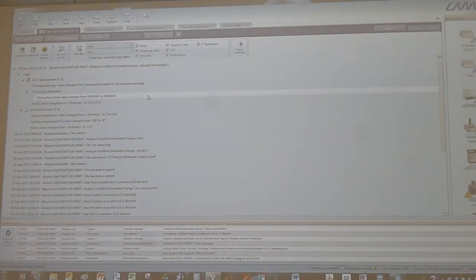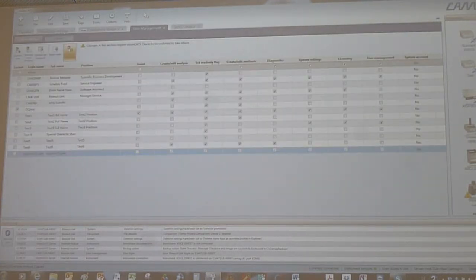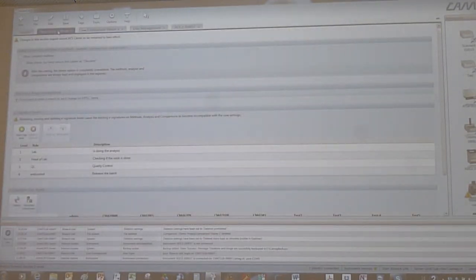There are other softwares where for each and every entry you can say, yes, you have to do a motivated change, or no, you do not have to. And then they are doing something and then I have to make so. It's really, I think the analyst doesn't like that. But I think we had to do that because it is really a request of 21 CFR.